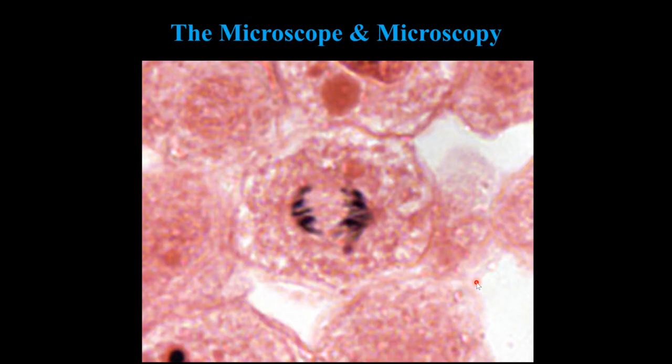Okay, got it? All right, good. What do we have here? Look at this. This is a picture through a microscope. A picture through a microscope is called a micrograph, and we have one here. If we want to study cells, and as I've said before many times already, physiology happens at the cellular level, we're going to look at some of the processes that take place in cells.